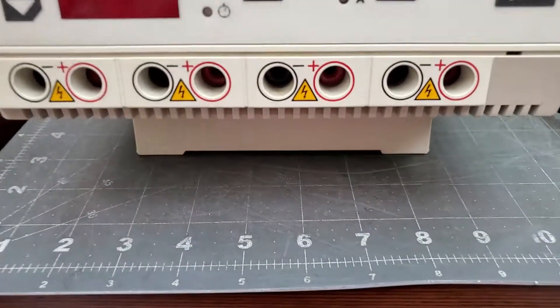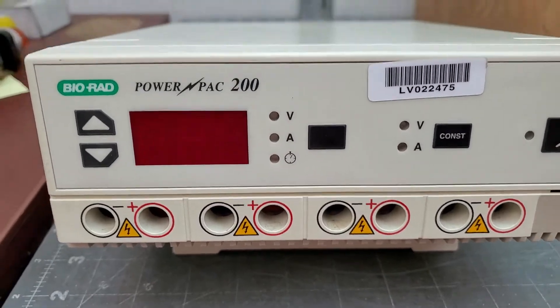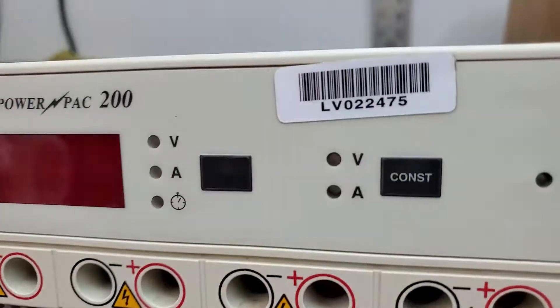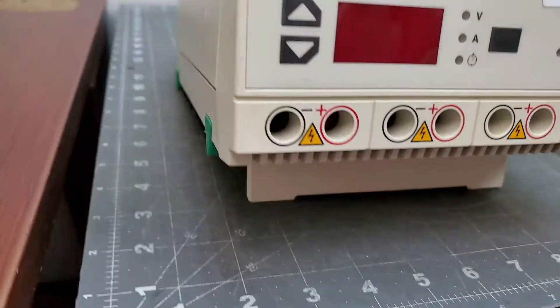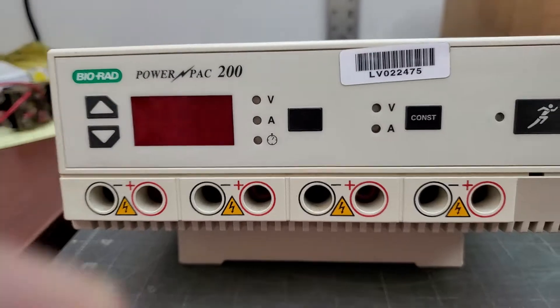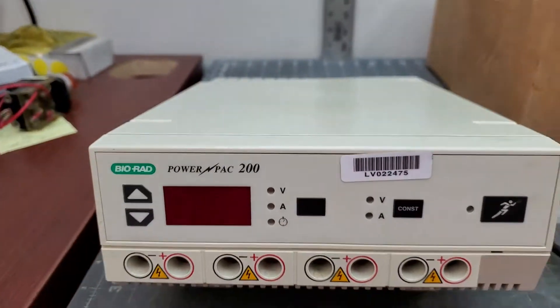You're looking at a BioRad PowerPak 200. This item is 110 volt and takes a D-plug. This item came out of the stock crib of a large pharmaceutical company that determined this to be surplus to their needs.